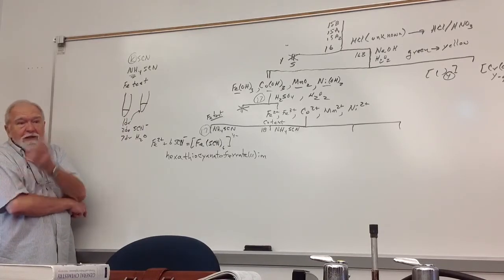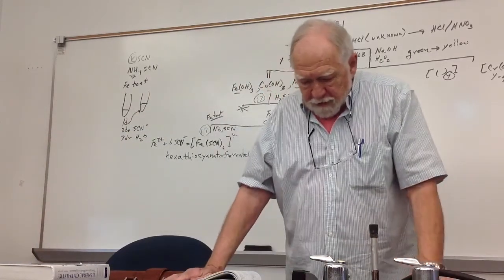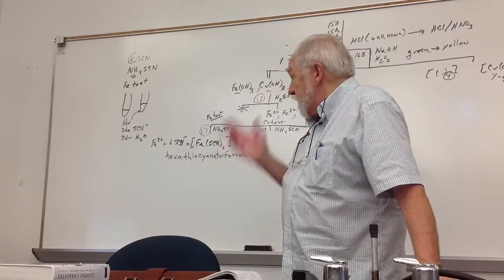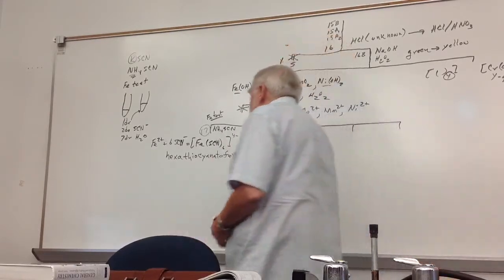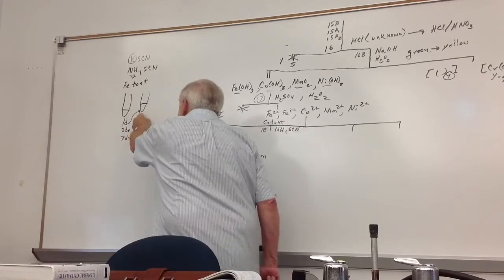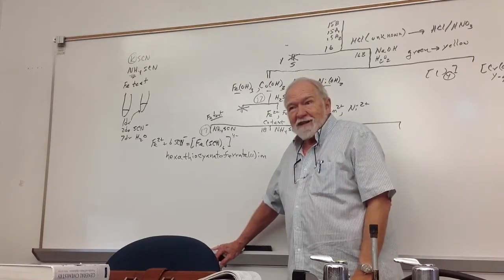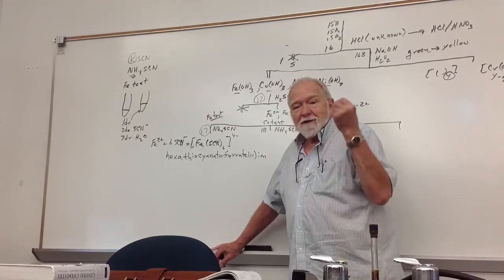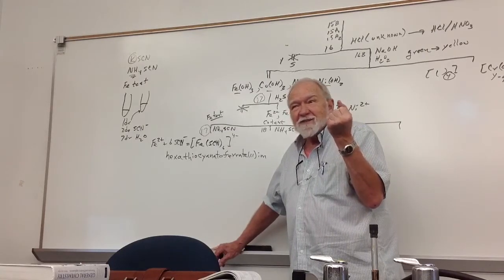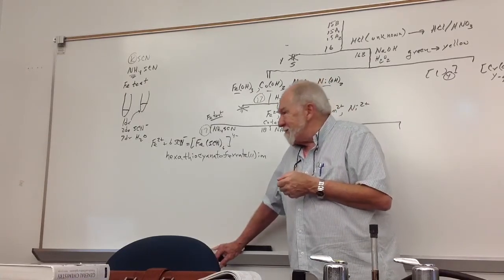So you can't distinguish between the two colors for the principal and the medium from doing that first complex formation reaction. So what you're going to do is do the dilution on your unknown and then see how it matches up. If you don't have iron at all, or if you get to this stage and you get such a really light color precipitate that is much lighter than this diluted one, what's your conclusion going to be? Yeah, you don't have any. You have a contamination. Because remember, if you don't report a trace, you lose 2 points. If you have a contamination, you say it's a trace, you lose what? 4 points.